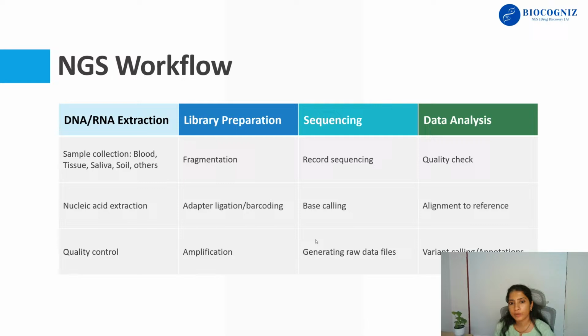And different platforms. So now let's see the principle behind NGS, like how it works. I'm sure you all understand that NGS is to know the sequence composition of our DNA or our genetic material in our cells. So how exactly are we going to do it?